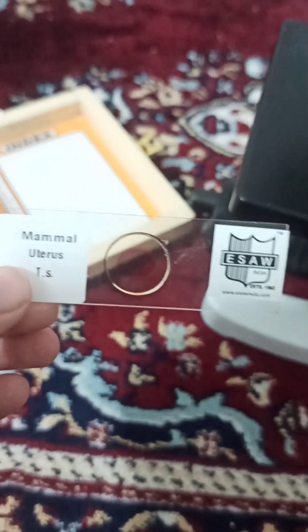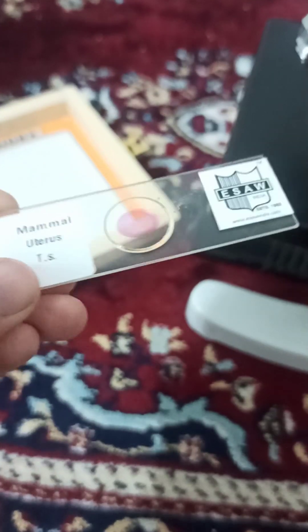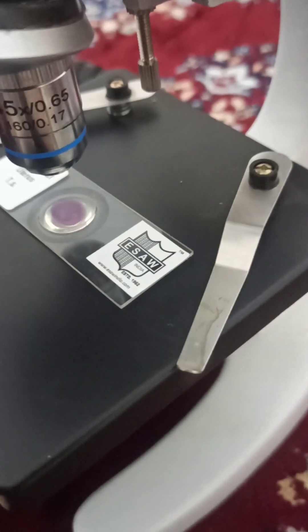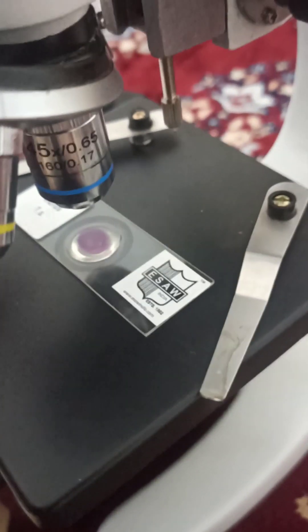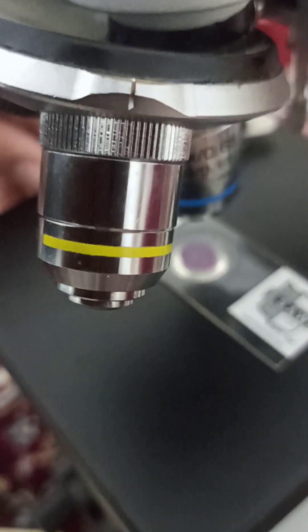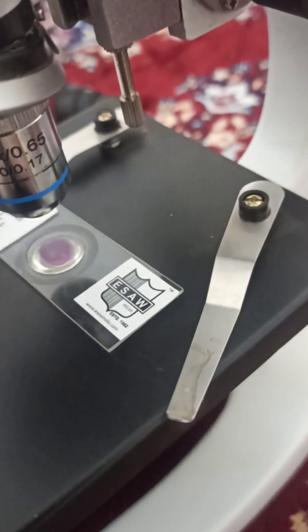Let us observe this normal uterus section under the microscope. We need to place the slide in front of the lens and use these clips to make sure the slide is in the right position and doesn't move.